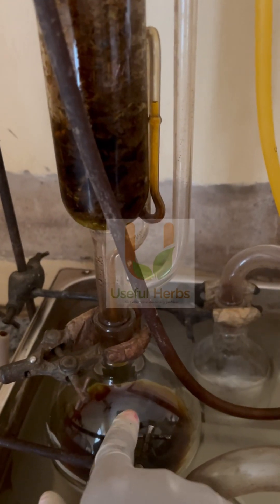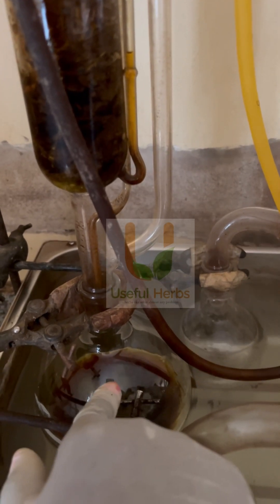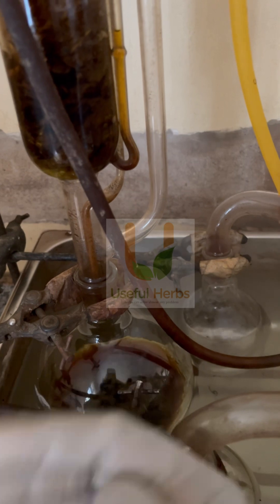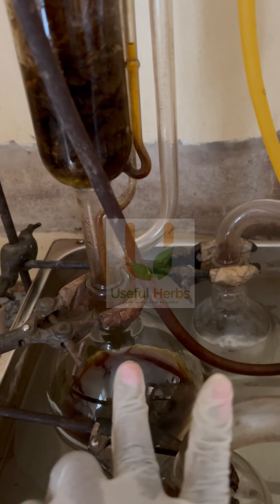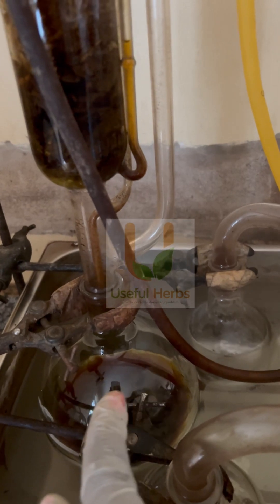That will be the crude yellow wood extract. From this crude yellow wood extract, I'm going to bring out the alkaloids and incorporate them into a product — a facial care product for people with acne-prone skin.